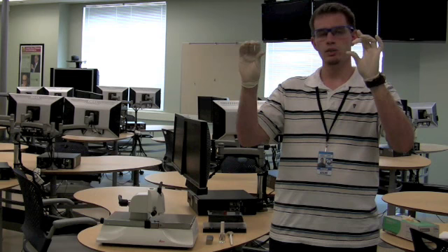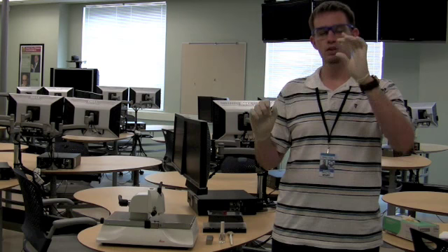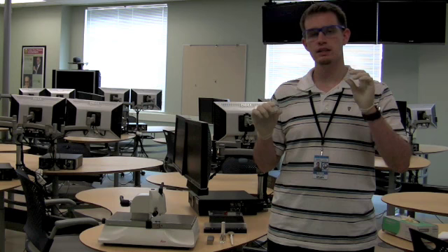Once we have that, we're going to take that square and create a break down the center, and we're going to create two glass knives from that procedure. After that's done, we're going to mount a trough against the cutting edge of the glass knife that's created, and that's going to allow us to collect our samples after they've been sectioned in the microtome.